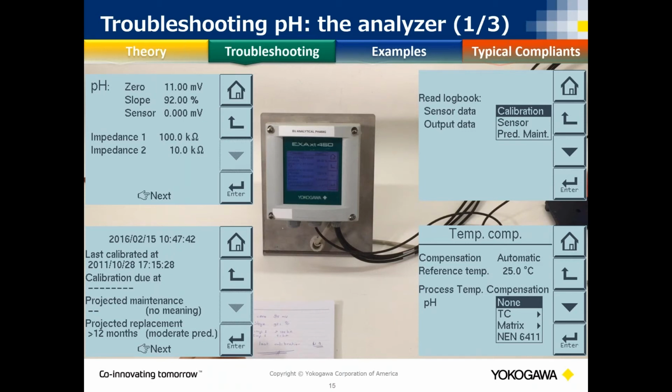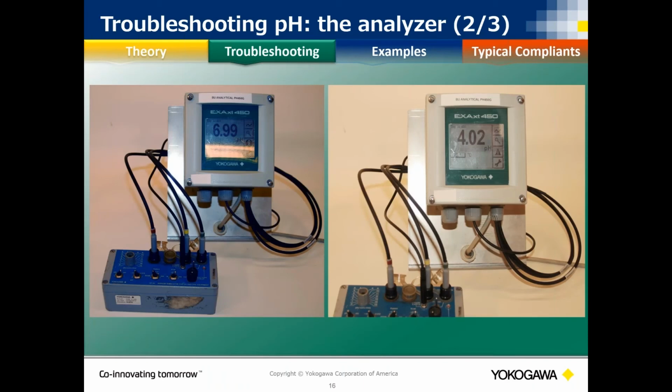On our analyzer, it's the bottom one shown there, to make sure that that's not what's causing errors or offsets in our pH values. So those are the data. That's what we look at first. We just look and we collect that data.